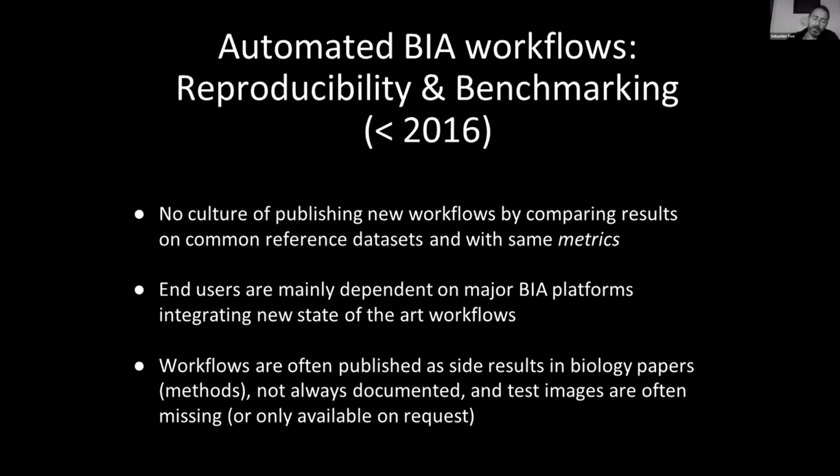So this was the first issue we could identify. Then the end users, for instance, biologists, were mainly dependent on the major bioimage analysis platforms, such as ImageJ, to integrate new state-of-the-art workflows. So there was a lag and a need for integration of these workflows before the big pool of end users could really use them. So this is another issue we thought.